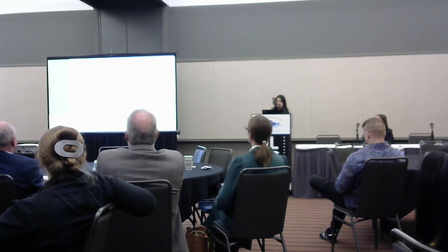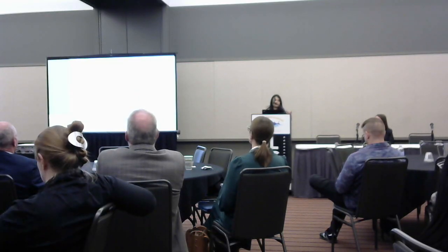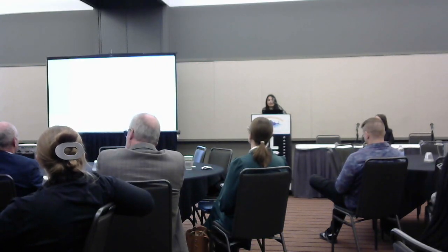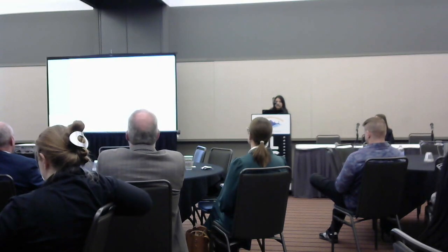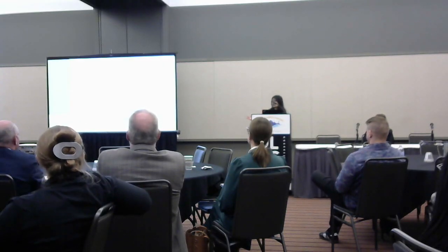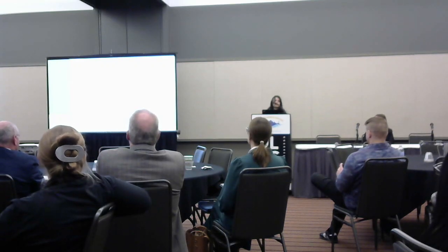And I want to talk about two use cases where we have actually used HPC for some of the microscopy data. One of them is for confocal data, going back to a high content imaging experiment done by one of the researchers, who was imaging several 384 well plates. It was a large screen of more than 800 mutants. They were taking 10 ROIs per well, and all of those images were multi-channel Z-stacks, and in some cases there were some time series also.